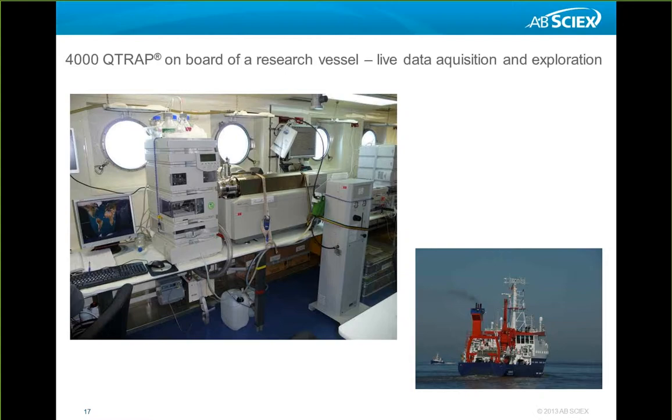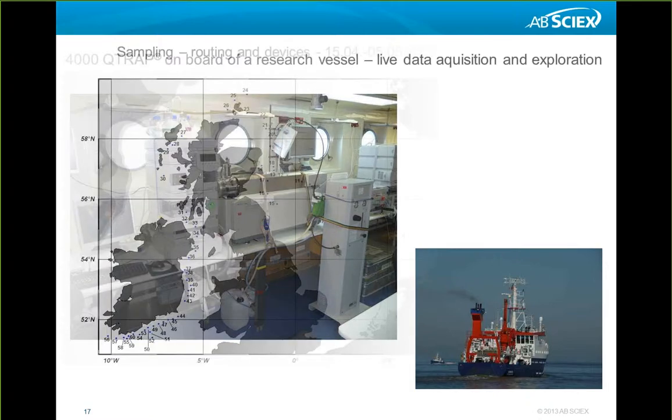Because the interesting story is that it's not always a toxic phytoplankton. It changes based on temperature, phosphate, nitrogen conditions in the water, salinity. So the more we know, and the quicker we get the result, the more we can tell and also discuss bloom formation and maybe give early warnings to shellfish producers.